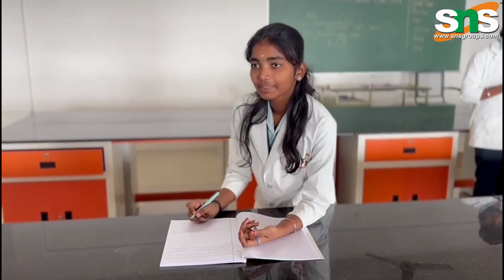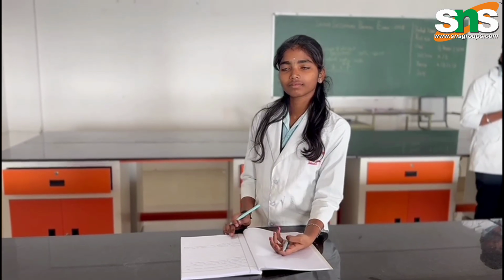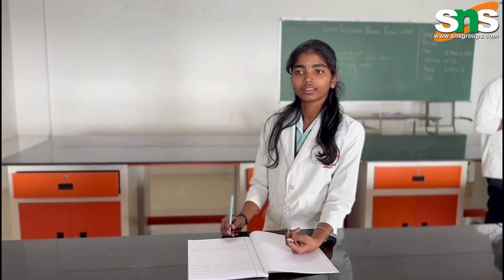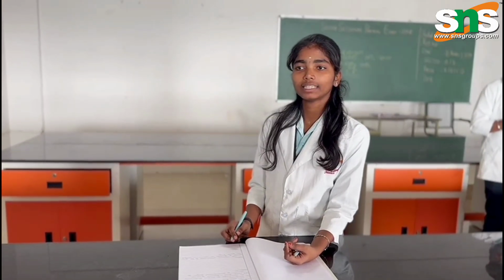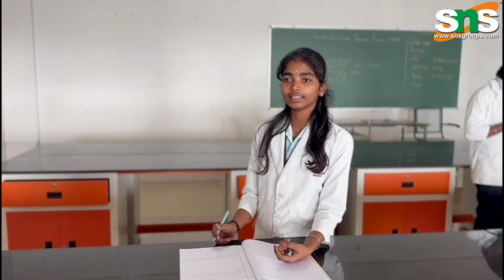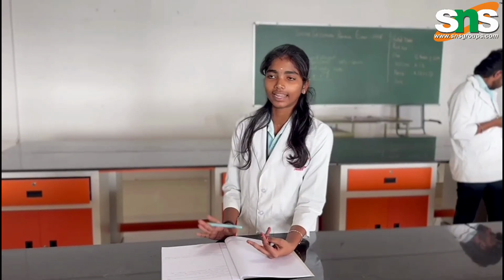And now the second question is, we want to check how cloudy or dirty the water is, that is called turbidity. Which instrument in our lab measures turbidity by looking at how the light scatters? It's the nephelometer. A bright light shines straight through the sample. If water is clean, light goes straight, with little scatter. If particles are there, light scatters in all directions. The nephelometer detects the scattered light at 90 degrees.